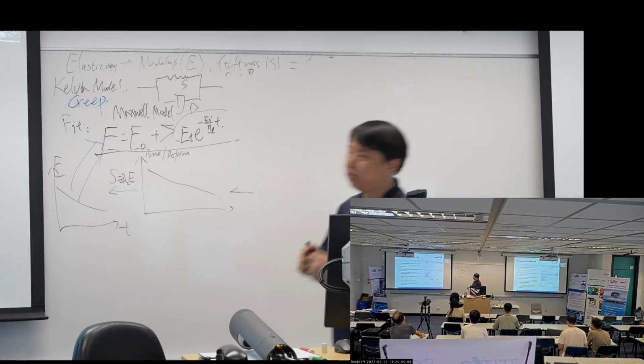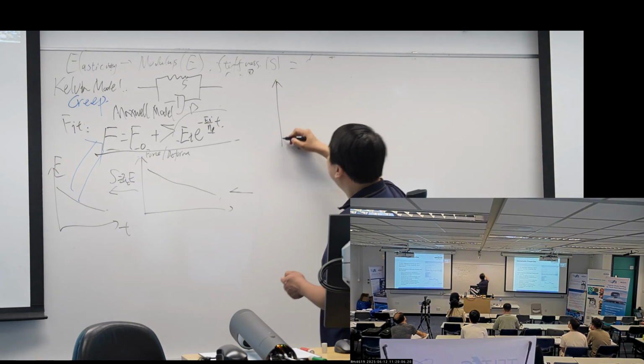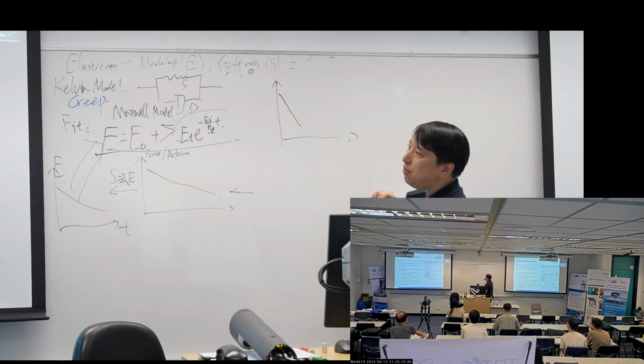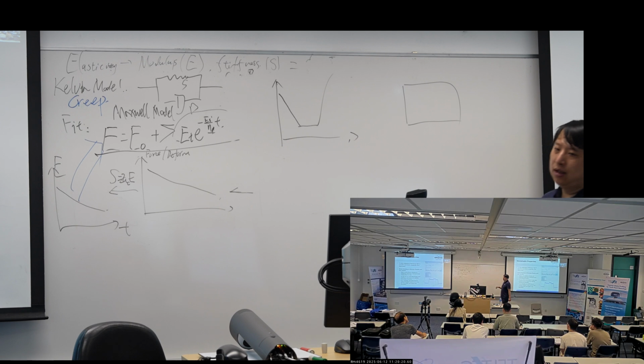For this kind of force curve, for ramp and hold, it's defined: moving up, hold, moving down, moving up. Sometimes the researchers' samples have quite complex structures.